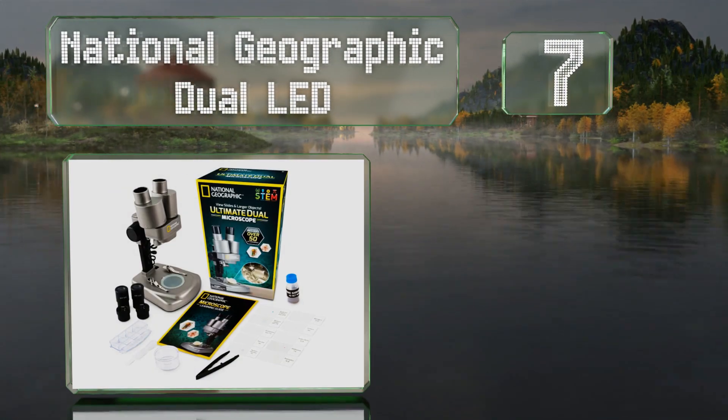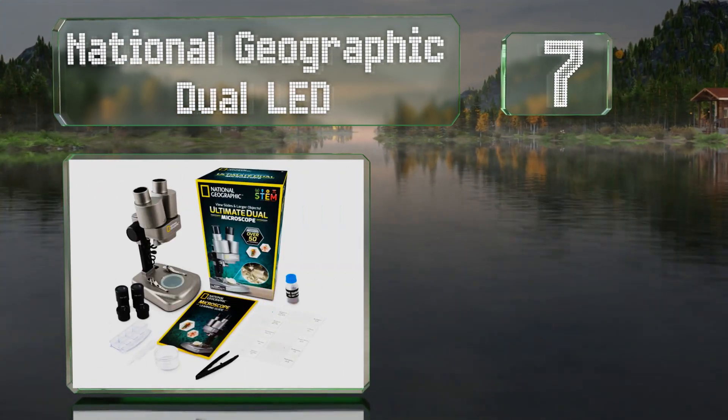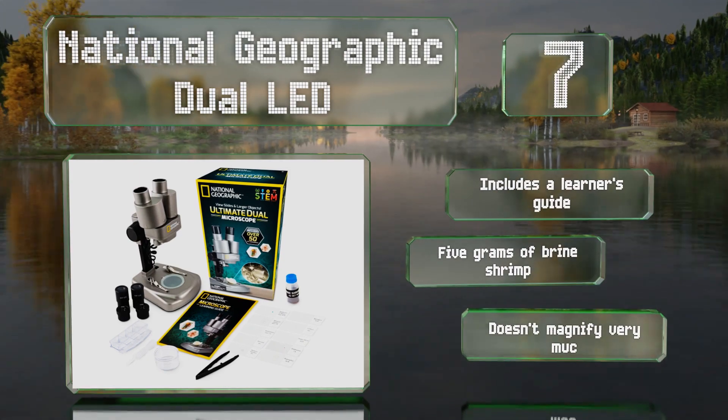At number seven, the National Geographic Dual LED is a versatile model ideal for studying subjects under direct light or for looking at specimens floating on the bottom of a petri dish. It includes a learner's guide and five grams of brine shrimp, but it doesn't magnify very much.